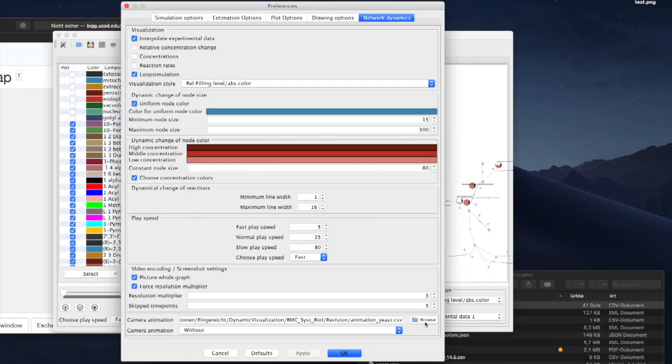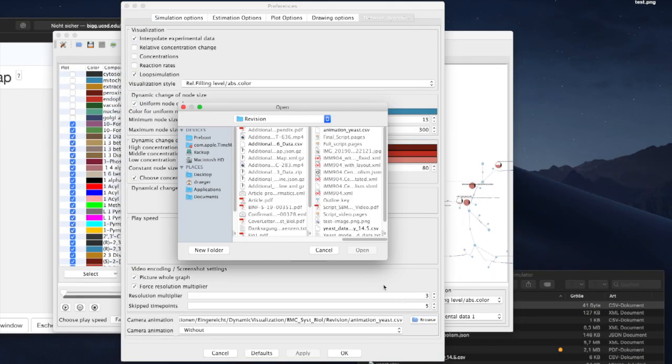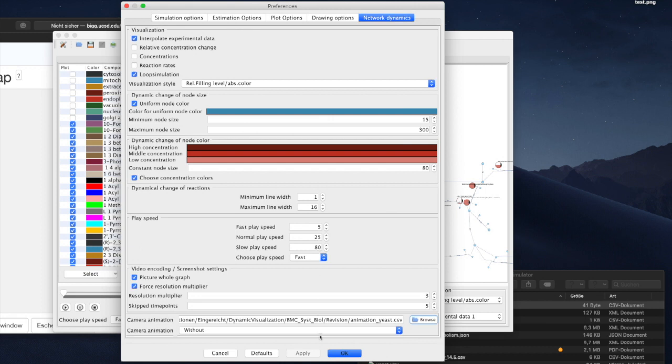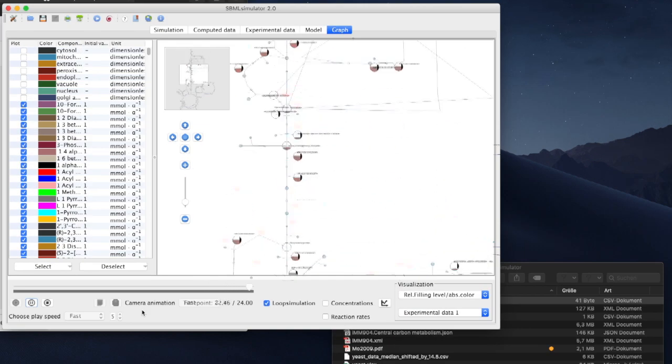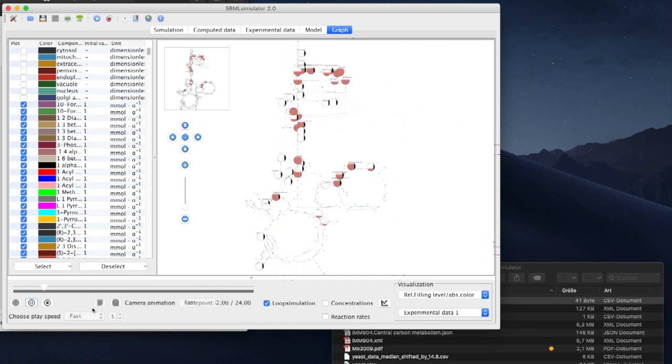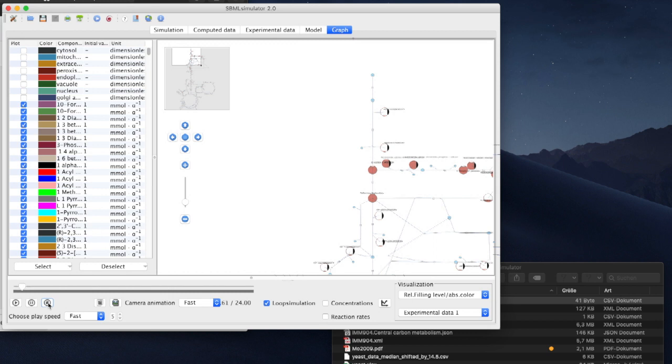Therefore, to enable the camera animation, we go to the settings and navigate to the bottom of the tab Network Dynamics.